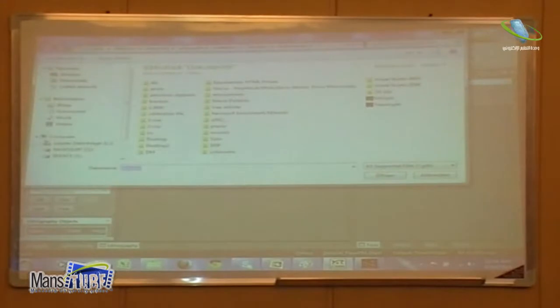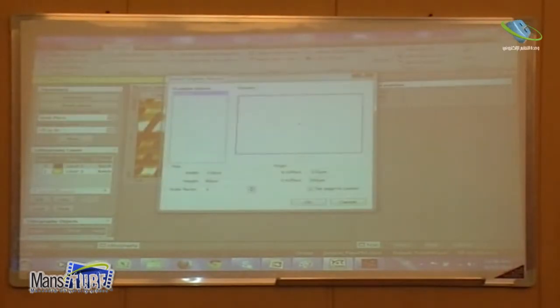Wait a minute. I will take it again. I make it a factor of 0.01. Then it's, let's say, 2 micron and 2 micron size. I mean, we can put it. If we remove it, we put the X offset and the Y. If I remove it like this, this is okay. I mean, here we can. I mean, this is the size, and here I want to put, let's say, the 0 means the center.